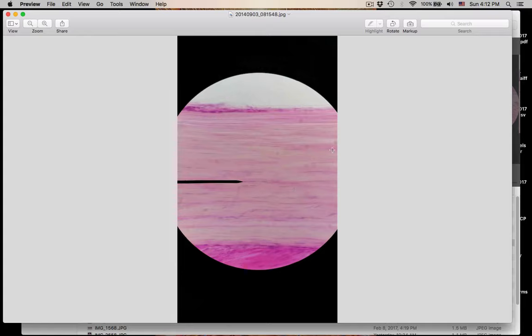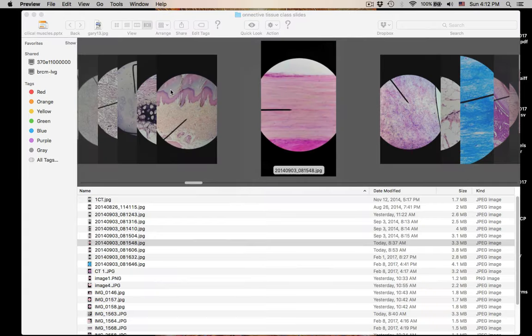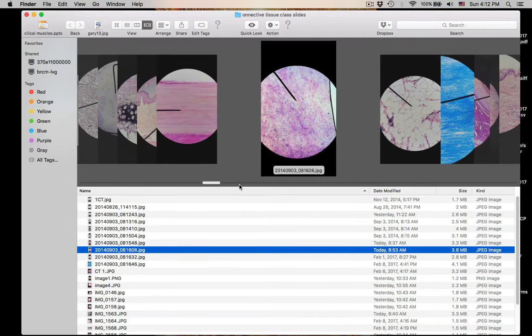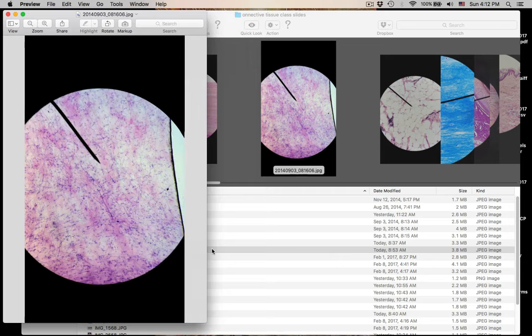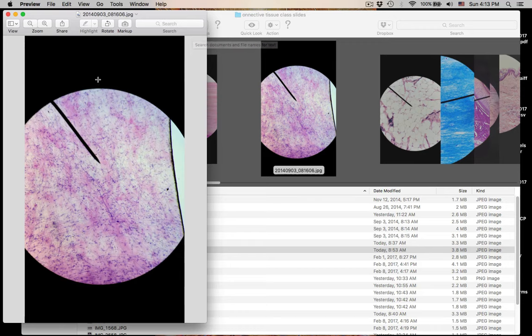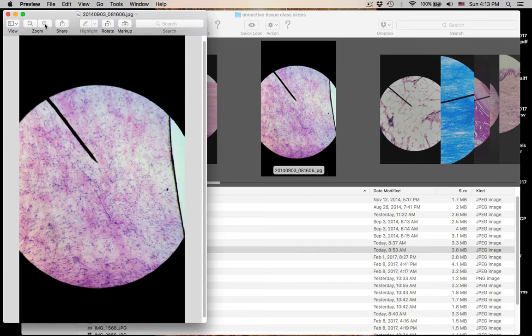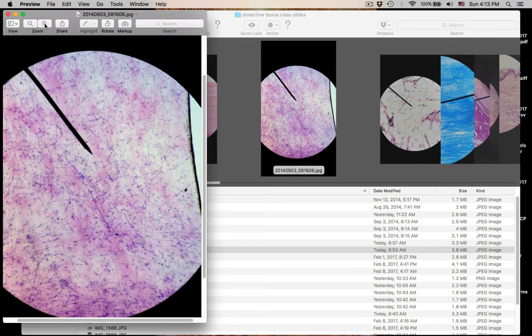Number eight: areolar connective tissue again. Easy to see that pick-up-sticks pattern of the protein fibers. That's number eight.